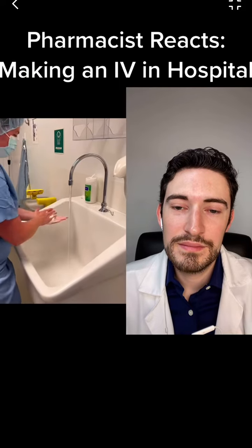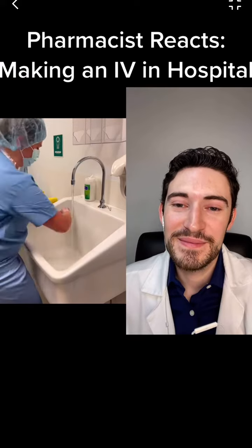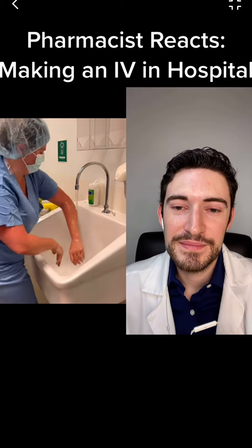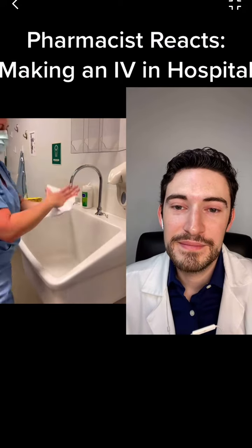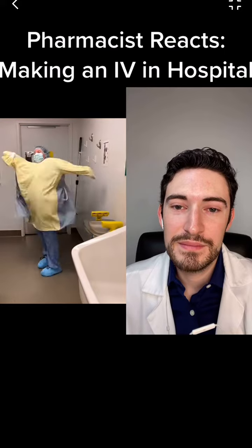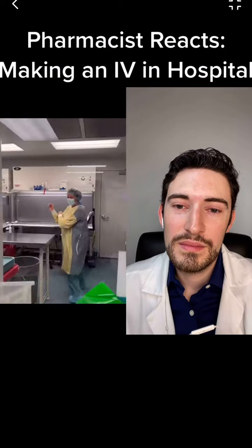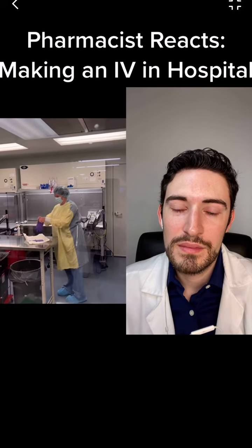Then I'm going to go ahead and wash my hands, making sure to clean underneath all my fingernails. And we're going to go ahead and do this every time we go into the IV room. Doesn't matter if you've already been in there for the day. Drying everything off after we have washed thoroughly. Putting on our gown, grabbing some sterile gloves, and we're going to put those on after our alcohol dries from our hands.